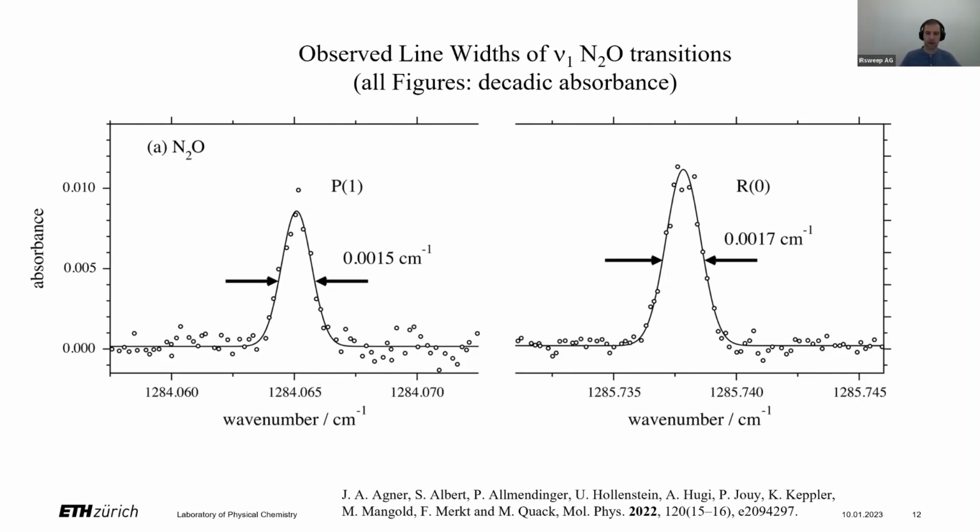Of course the signal noise always depends on the integration time, but typically what we get is 10 to the -3 absorbance units on 100 microsecond time integration, and then you can estimate the limit of detection from your absorption strength. Patrick Dupre asks, can we have an idea of the sensitivity on N2O you show in 0.1% and the absorbance?